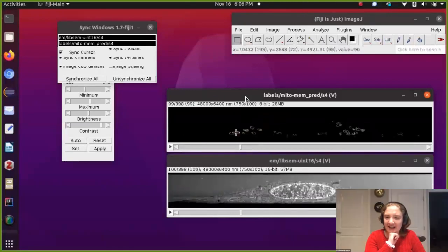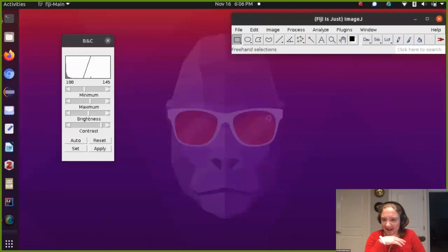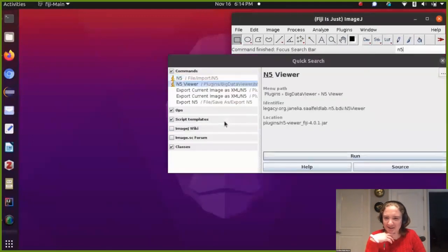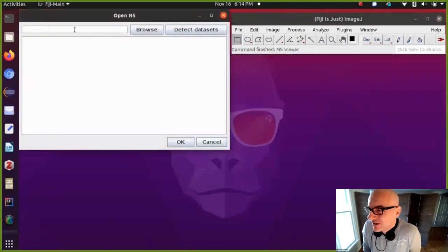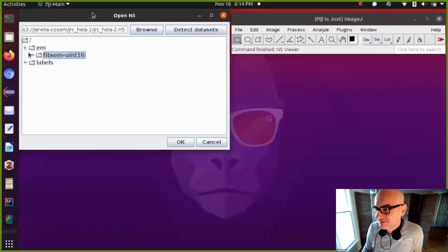Yeah, I think I opened a Zarr and then somehow in Fiji tried to convert it to an N5, so I could open it in Big Data Viewer, which is what I wanted because it was a big data set. It did that automatically. It took a while, and then with an even bigger data set, I ran out of memory. So it depends a little bit. There's a historically grown set of things. That's maybe a bit unfortunate.